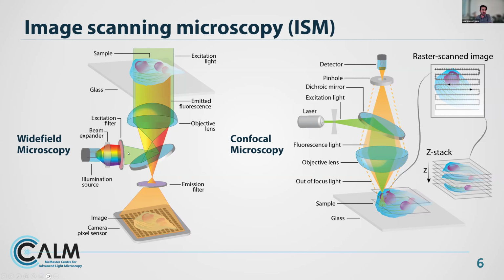In this case, we have, for example, a TRITC filter cube, which has an excitation filter that allows green light to pass through. Then the second component of the filter cube is a dichroic mirror. The dichroic mirror is going to reflect that green light up. And this is an optical diagram for an inverted microscope. So the objective is looking at the sample from the bottom.